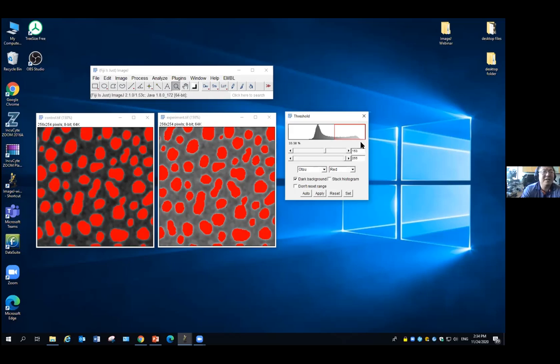But if you use the thresholding method, rather than choosing a fixed value, you choose the algorithm to calculate it. It can compensate this really well. I'm going to pause the screen a little bit, in case there are any questions on this. So one of you also asked when the local adaptive threshold is necessary. That's what we'll talk about in the next section.